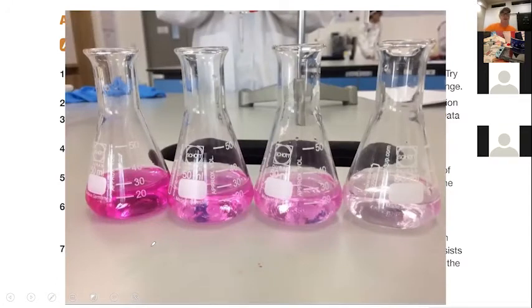So the color change should look, I mean, for the perfect titration, you would have a color change that looked like that. But that's really not going to be possible for us for a number of reasons. One, we're using a syringe, and it's very difficult to add like a 1/4 drop or a 1/2 drop the way you could if you had the burette.